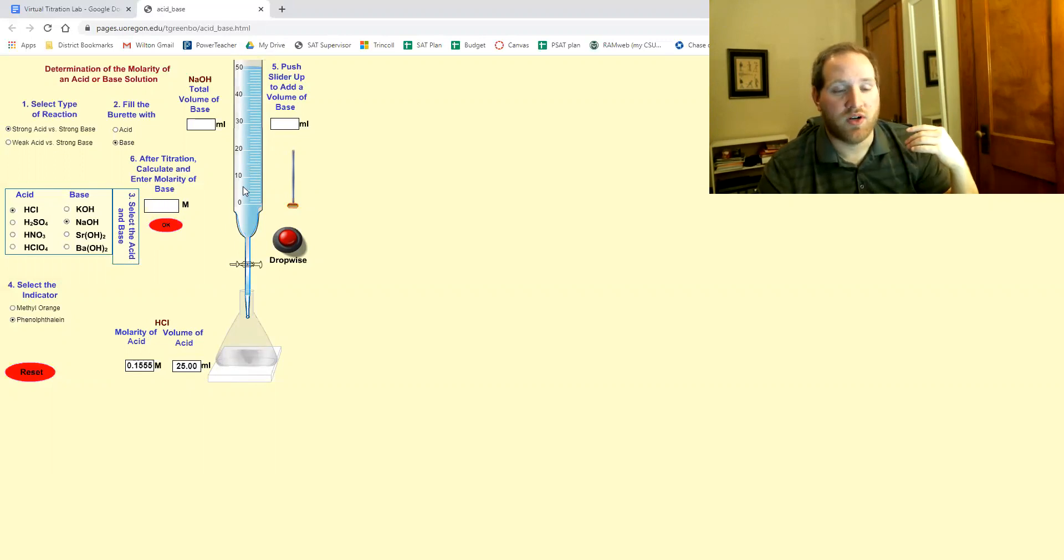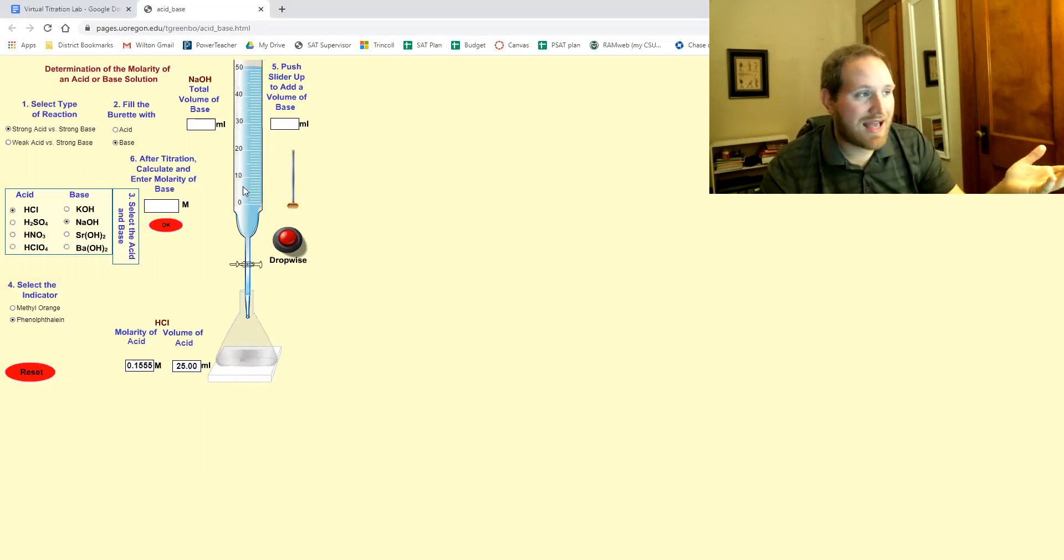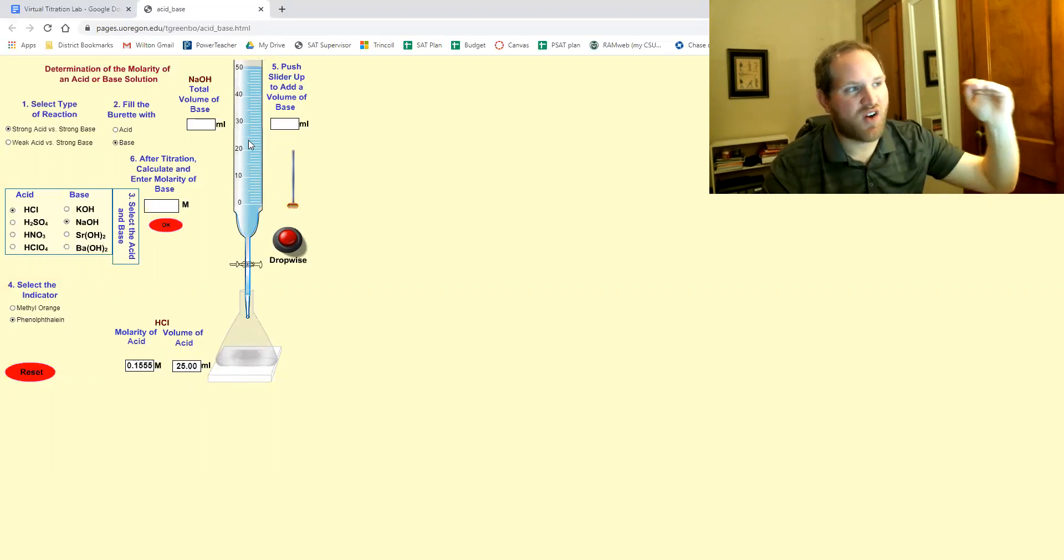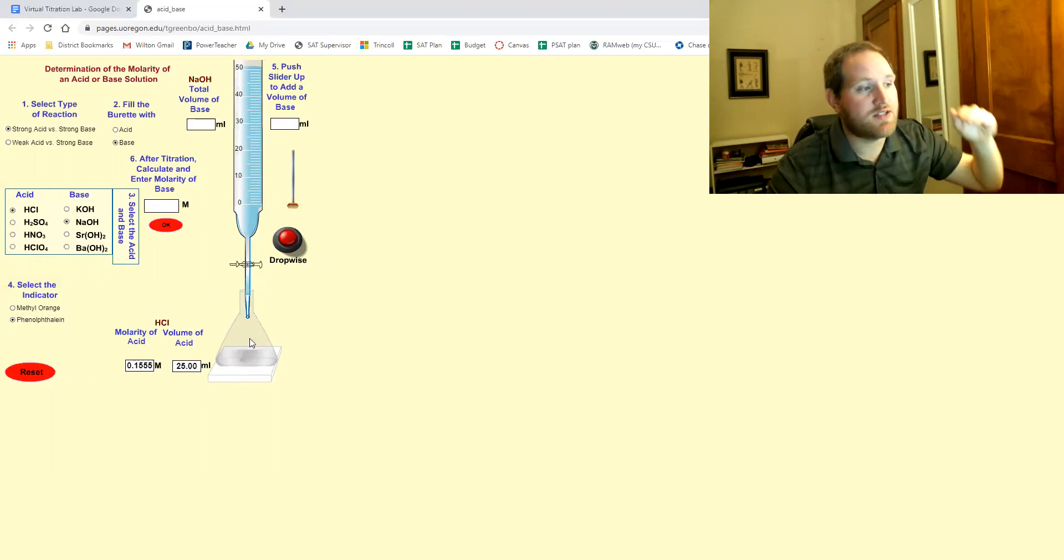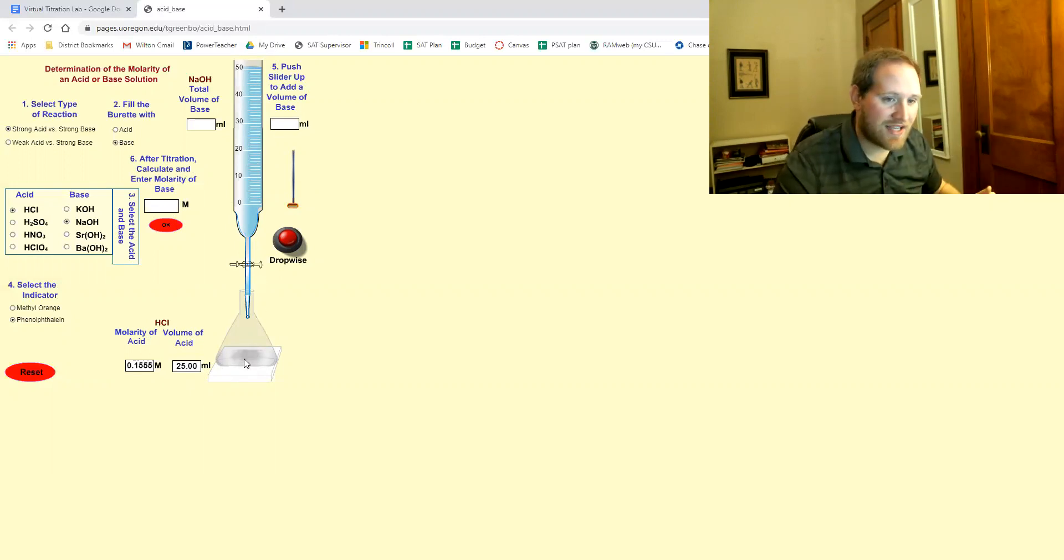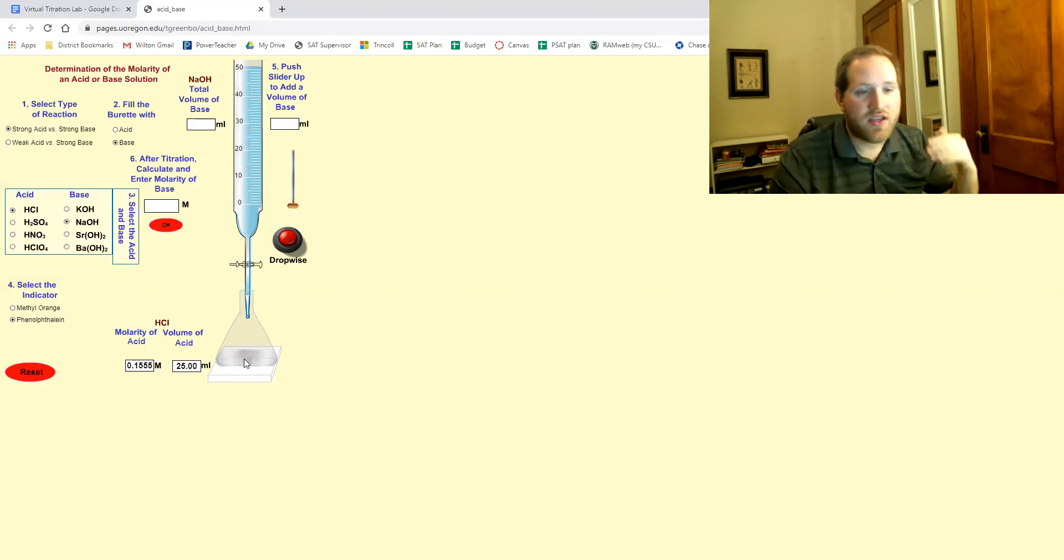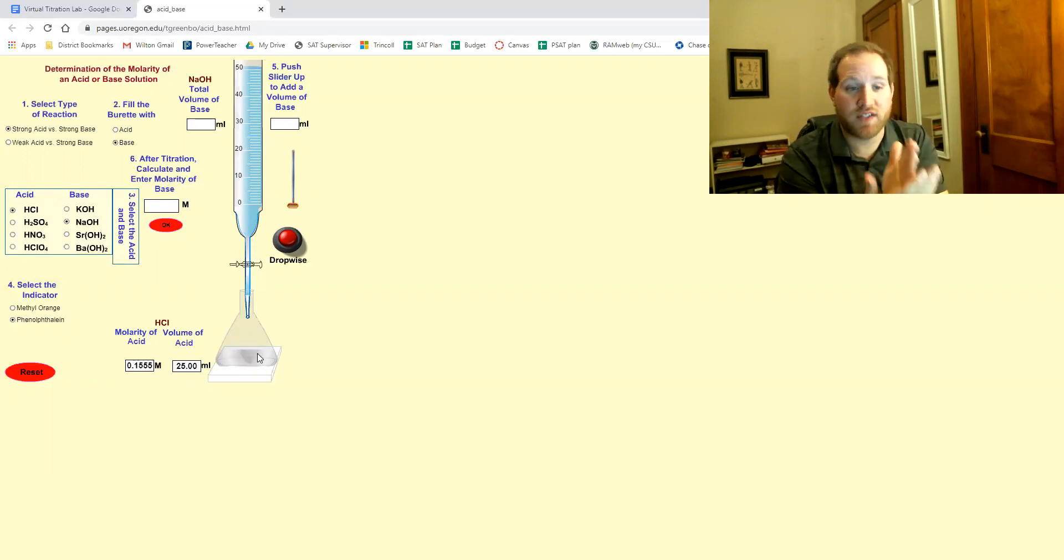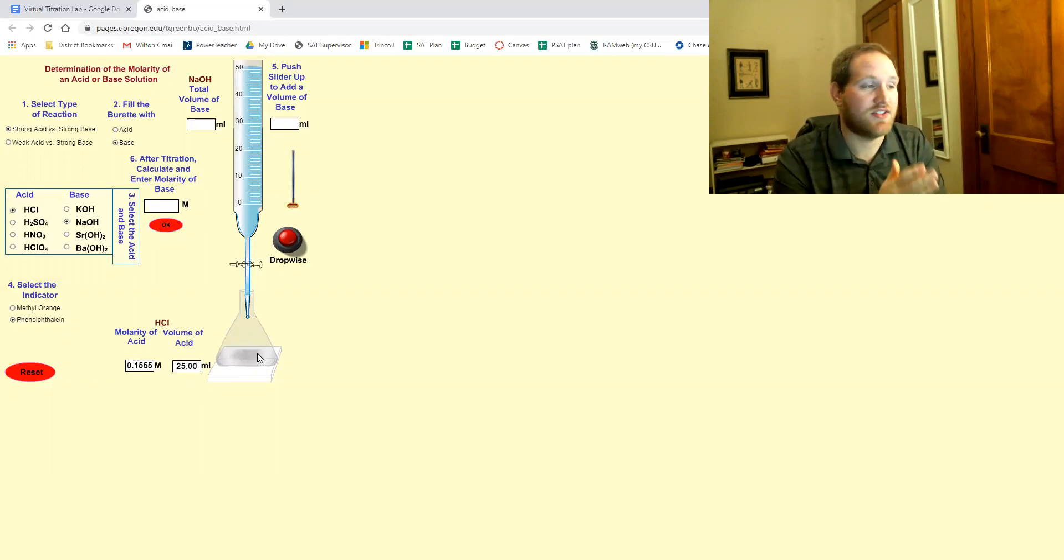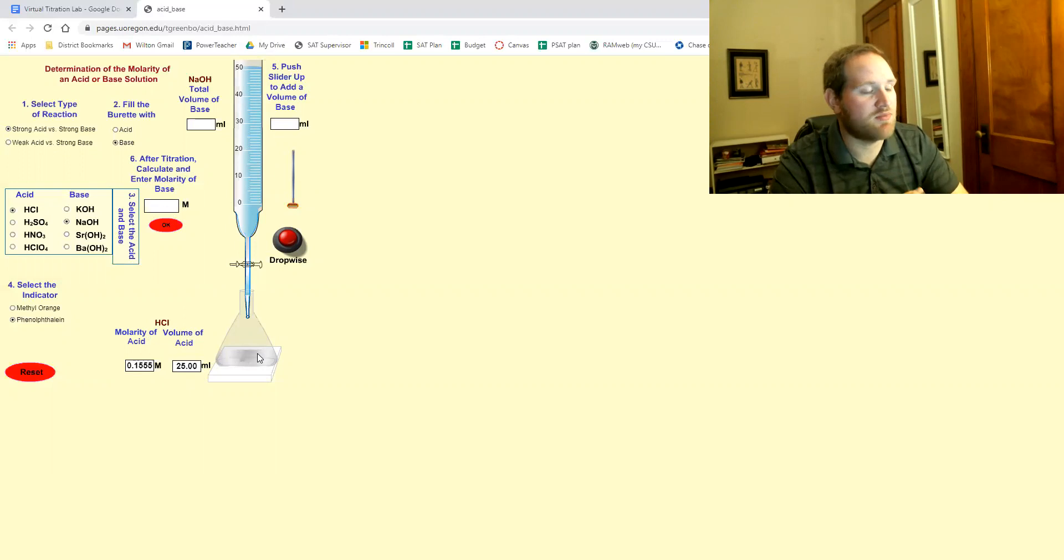And what we're going to figure out in the lab is the volume of base that needs to be added to this acid in order to perfectly cancel it out, to neutralize it, to reach what we call the equivalence point.